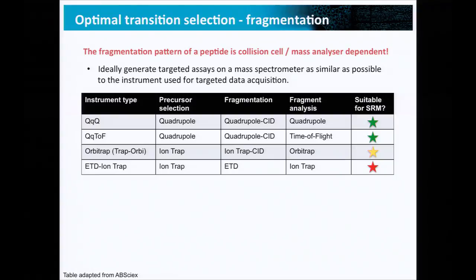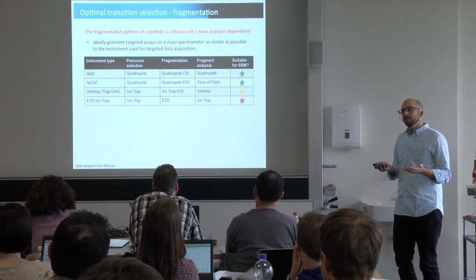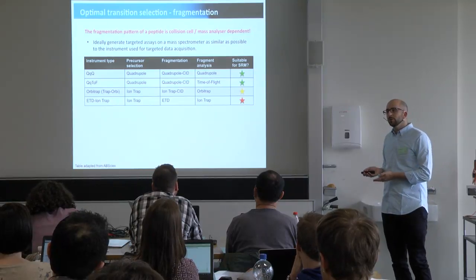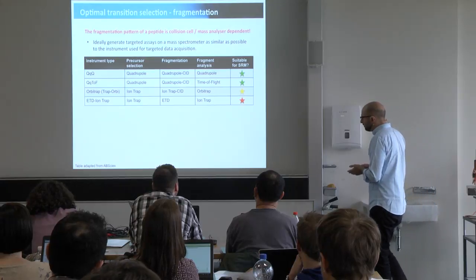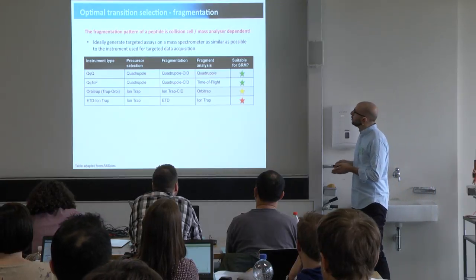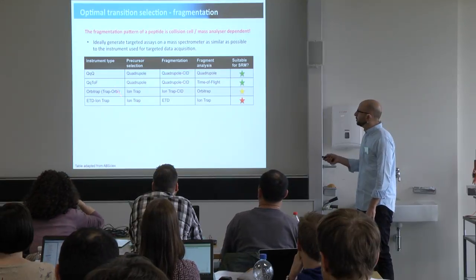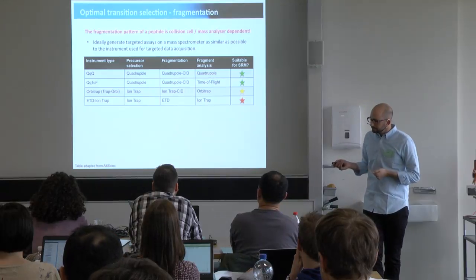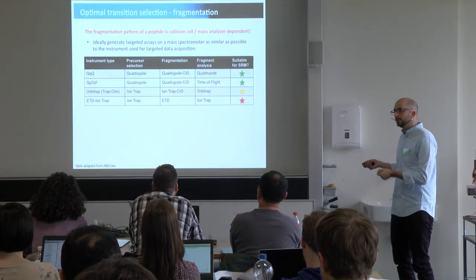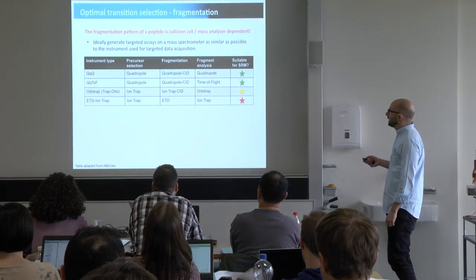And then we would get a dot product which is not very nice, and we cannot know: is this a bad dot product or a good dot product? And there are different ways of comparing machines, so it depends a lot on how the precursor selection is done, how the ions are being transferred even before the Q1, what type of fragmentation, how are the fragments analyzed.